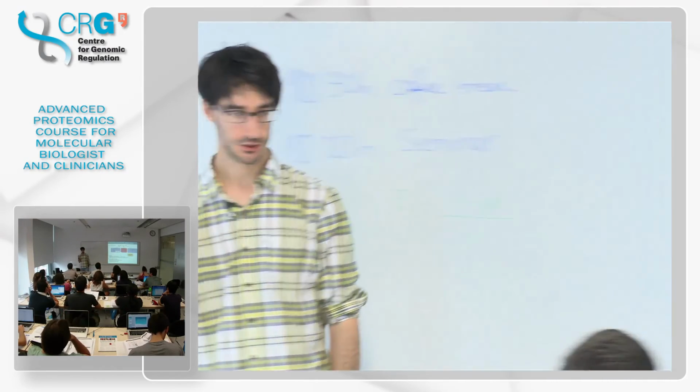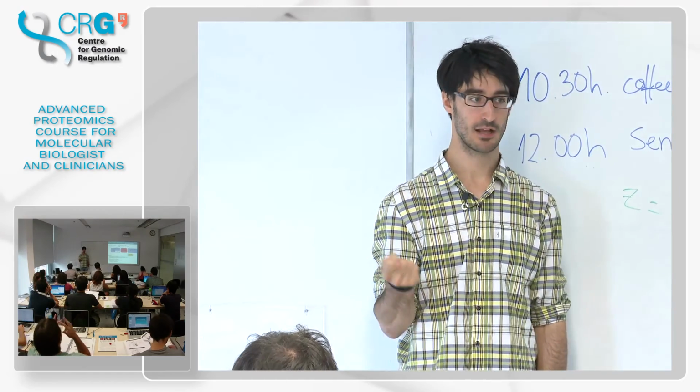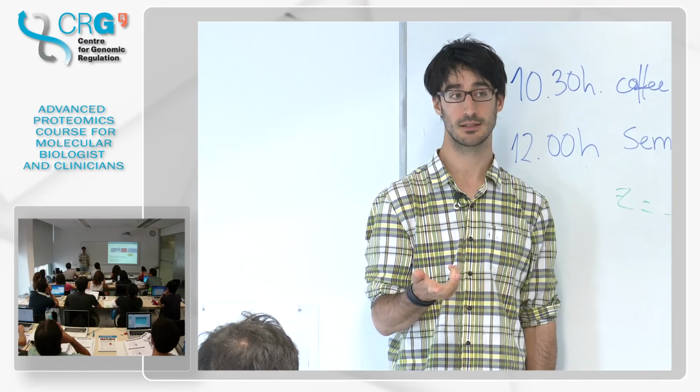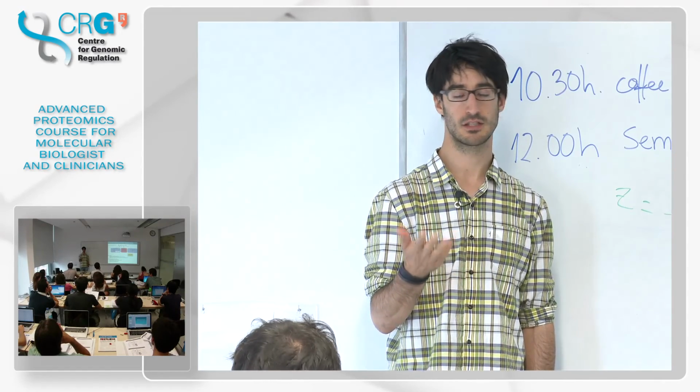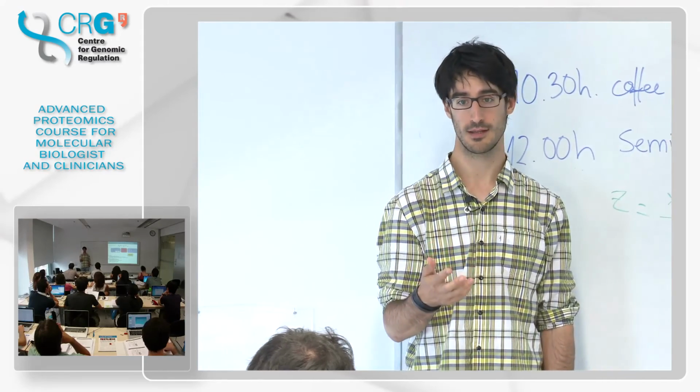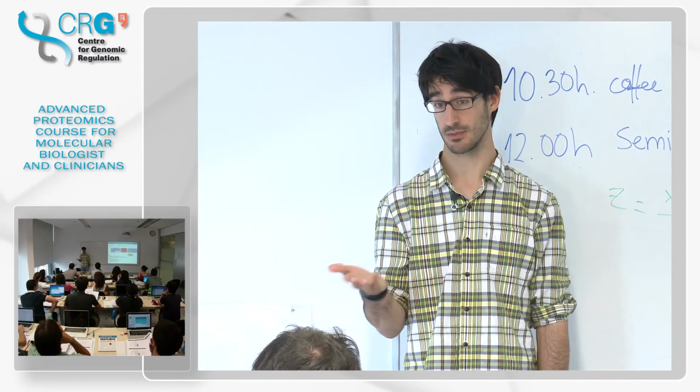Yeah. So be very stringent when you select your data and your network, and try to make it as specific as possible. And always take into account how many data points or signals, how many measurements you have.